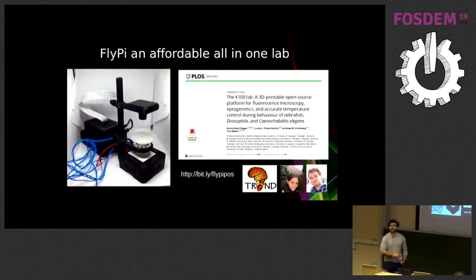So working with Trend in Africa, together with Lucia and Tom, we started playing around with hardware. This was about 10 years ago when we first started. And we found the Arduino platform, and we started as biologists, very simple: blink an LED, read a temperature sensor, and things like that. We started applying this, and things got more complex over time. And I think for all the engineers here, this is still going to be like a weekend project, but it took us a little bit of time because we are not from that background. Eventually, this came out as a publication where you can read all about it in more detail if you follow this link.